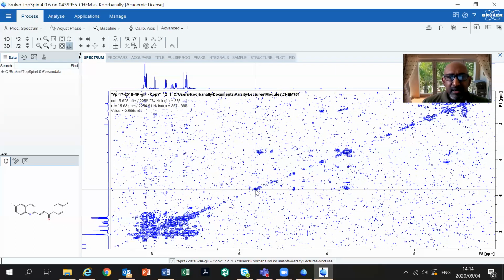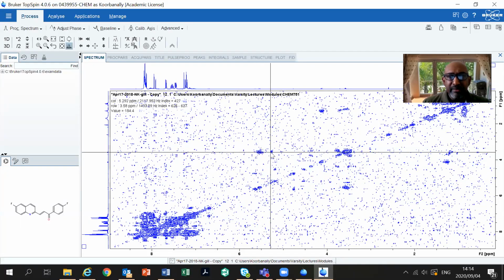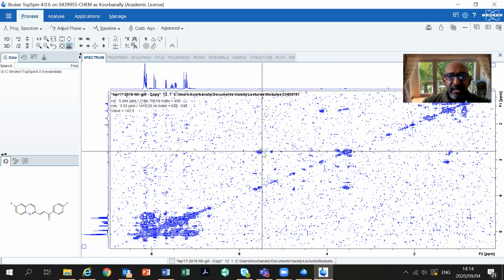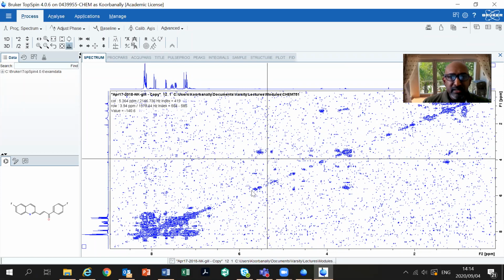Those might be bigger structures, maybe tall buildings, maybe all the high rises. I want you to try and think in 2 dimensions now, or even 3 dimensions if you can, that these are structures pointing up. So these peaks that you're seeing, which are more pronounced than the other peaks, are the taller structures.